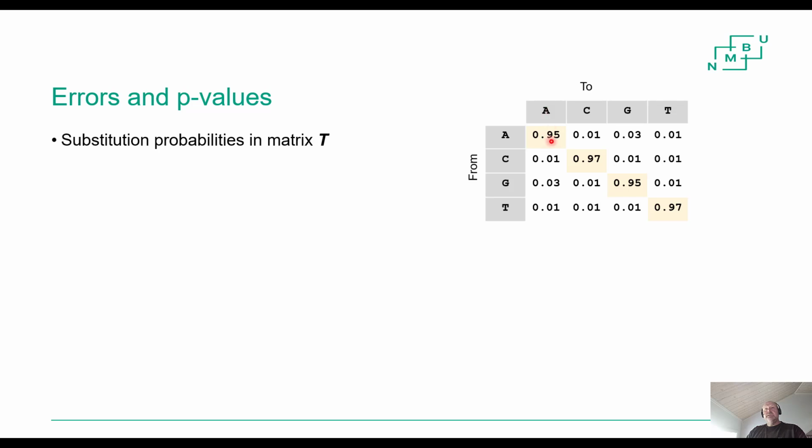And that's typically a high probability, because if the sequences belong to the same cluster, they should be similar to each other, right? So if the centroid has an A, the other members also have an A. That's the most common case, but some will deviate, right? There are small probabilities of deviating. And this is the same if it has a C: these are the probabilities of the 4 bases. If the centroid has these characters, these are the probabilities of the members having these characters.